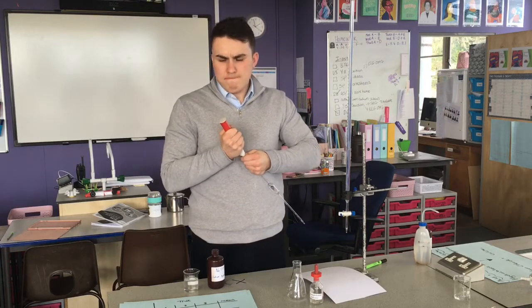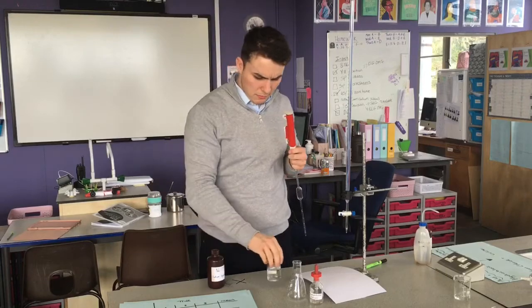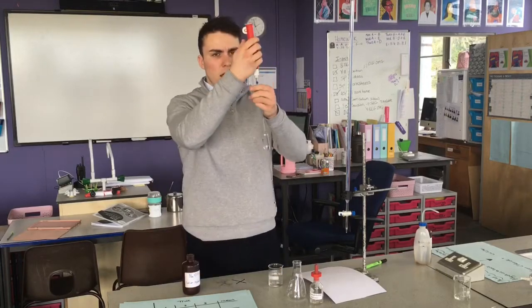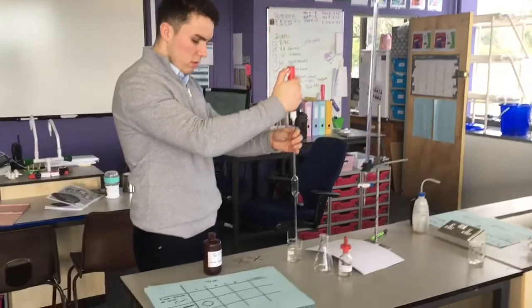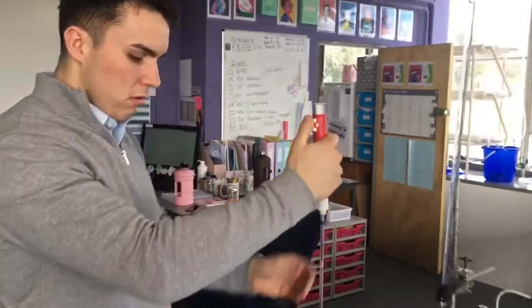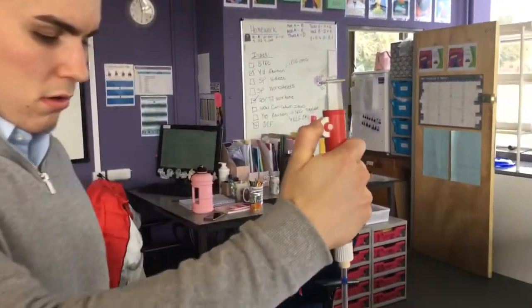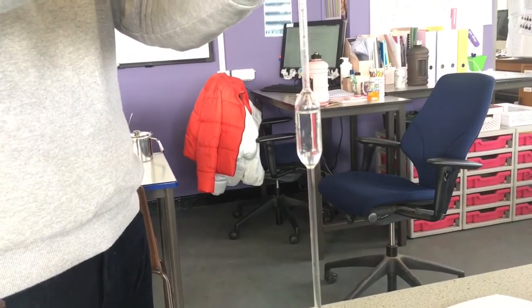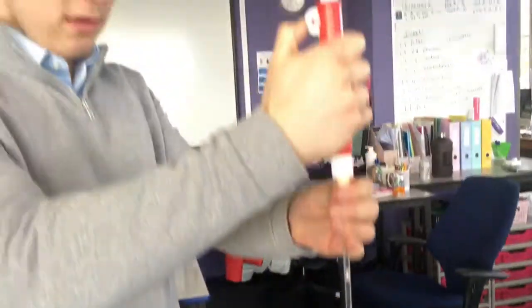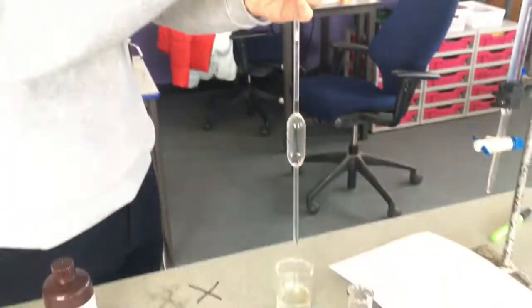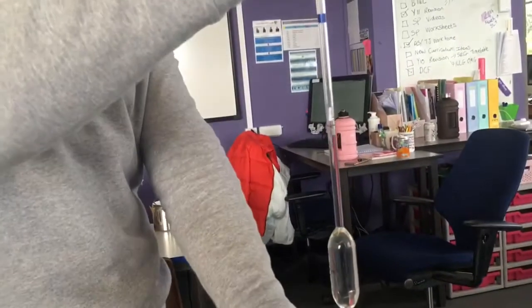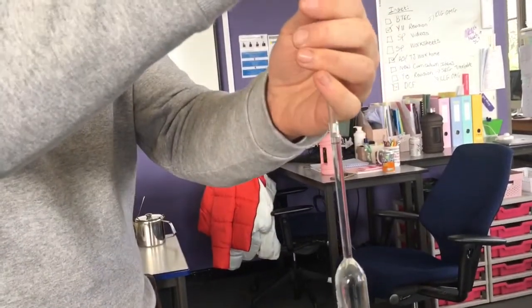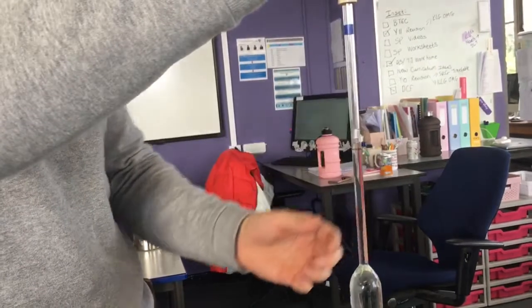I've got my beaker of base, and I'm just going to turn the wheel to begin to fill my glass pipette. It's going to go very quickly, and I'm going to slowly hold on to it, move it tighter, until it's on my glass line there.